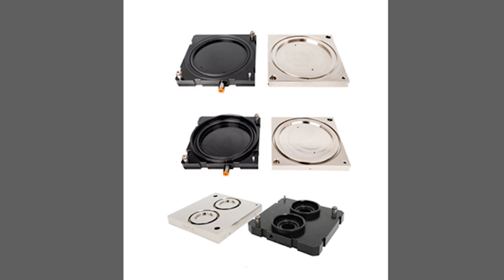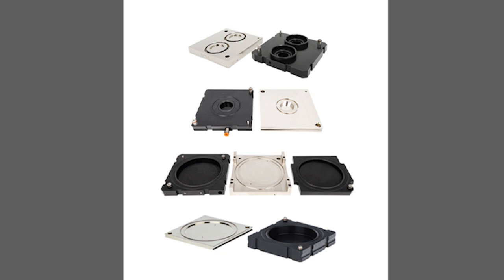We'll mount it onto here. We've got an O-ring, and we've got this top area that we're going to seal with some sealing grease. This goes on top of it, kind of like a clamshell, and then your material to be tested is in the middle here. This allows us to sweep oxygen, water vapor, or CO2 underneath the film, and our nitrogen or carrier gas on top of the film. So these two come together, and then our instrument itself has drawers in it. It goes in, and then it pneumatically clamps into place.